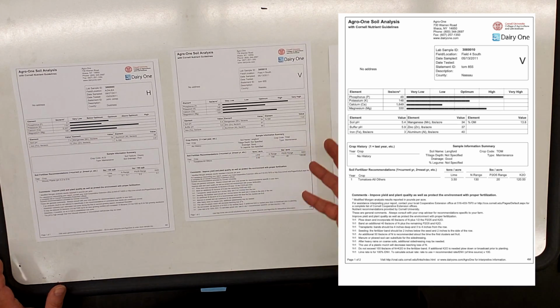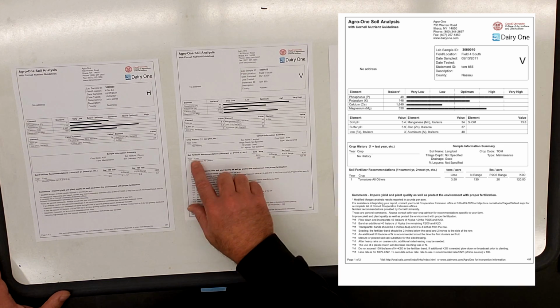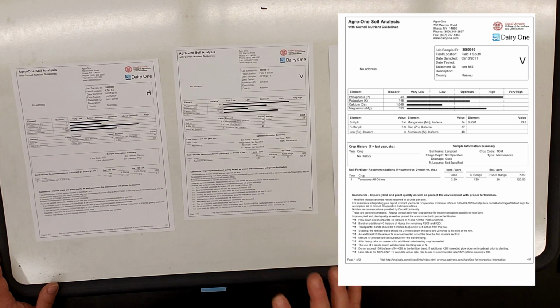And then just catching what you submitted, making sure that it's there. The next piece of information is actually the recommendations. This is where they're going to tell you how much X, Y, and Z, or nitrogen, phosphorus, and potassium, as well as potentially liming agents, you need to put on this field for optimum growth.